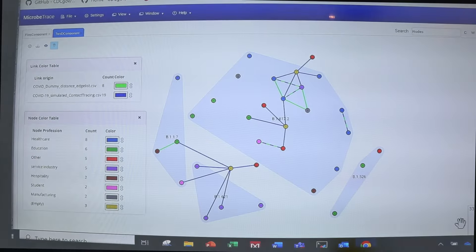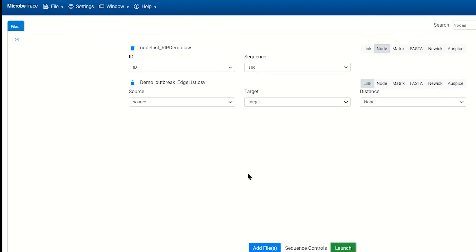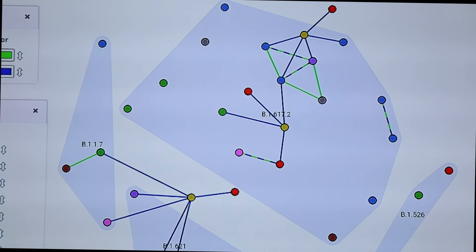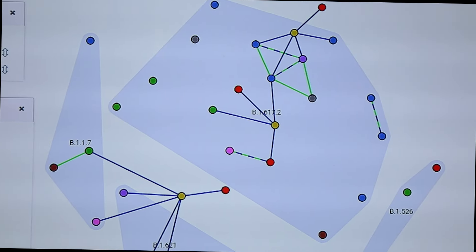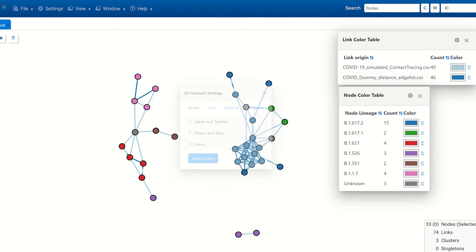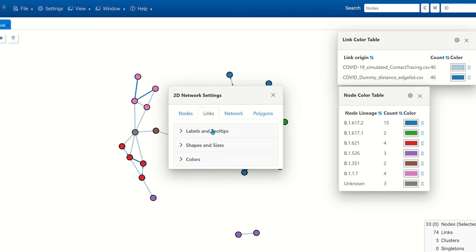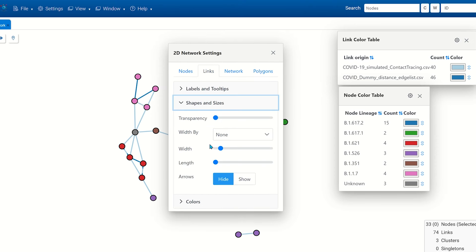Using simple point-and-click interfaces, data from surveillance, epi investigations, and genetic analyses can be readily imported, integrated, and visualized. No coding required.